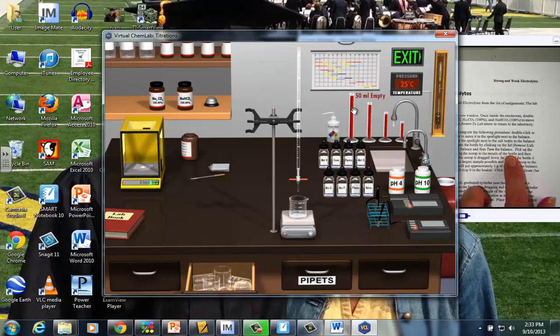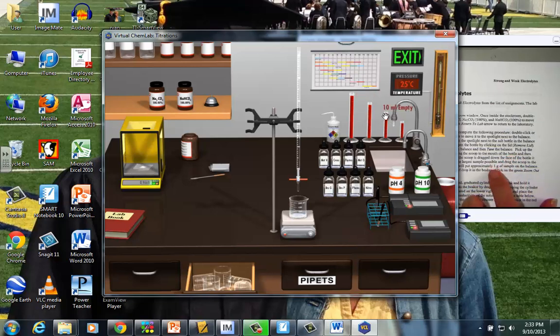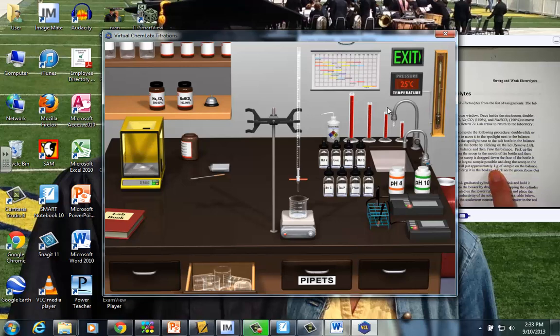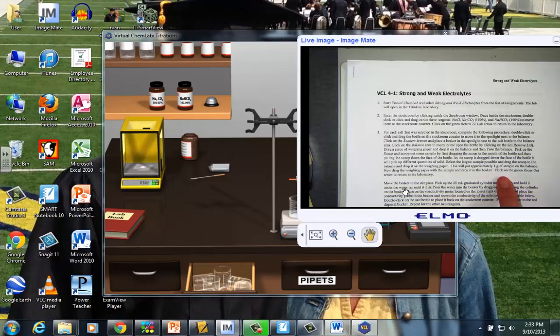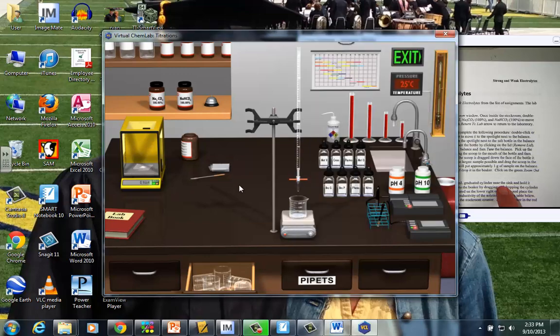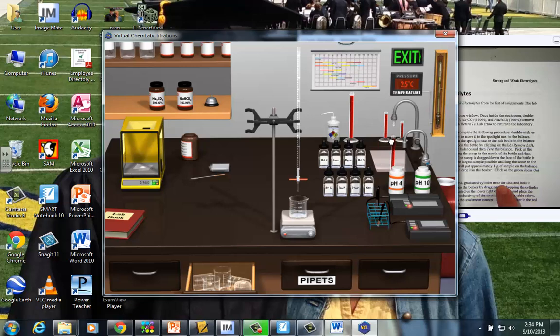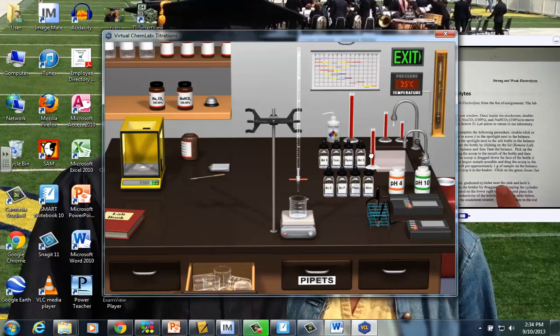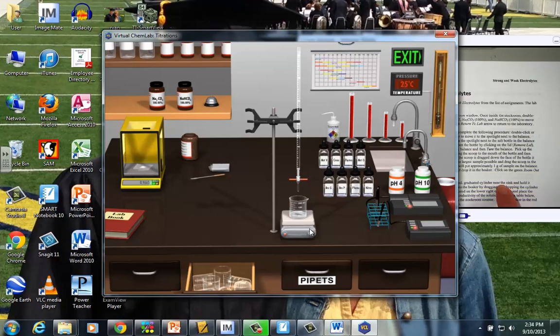Next, over here we have some graduated cylinders, and right now from the 5 mil, here's 10, 25, and 50 mils. Our directions tell us to take 25 mils of water. We're going to move the beaker to the stir plate, add 25 mils of water. If I just grab the 25 mil grad cylinder, place it under the sink. Hear that water pouring? It turns right into that grad cylinder. So now it's reading that it's full. Click and drag that grad cylinder to the top of your beaker, and just pour that water in.